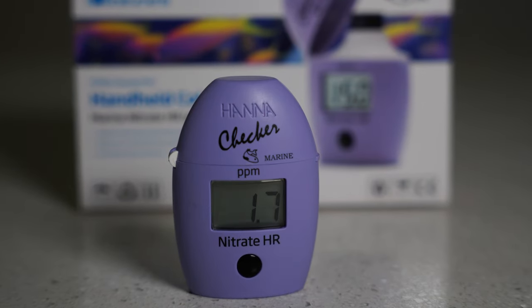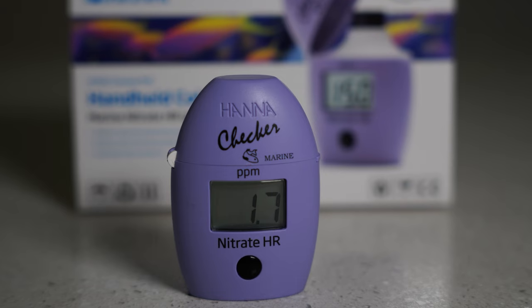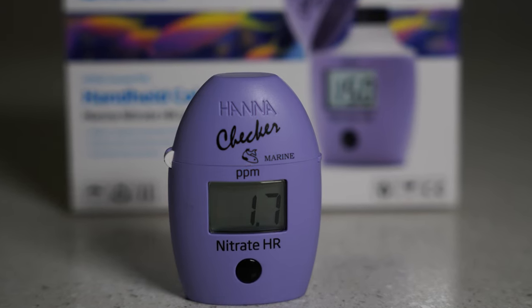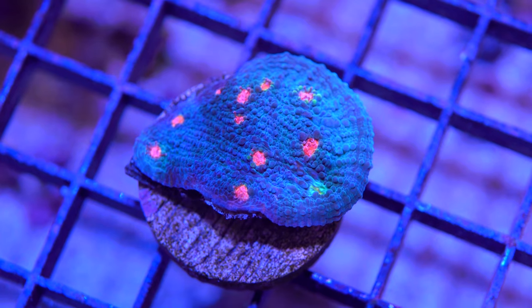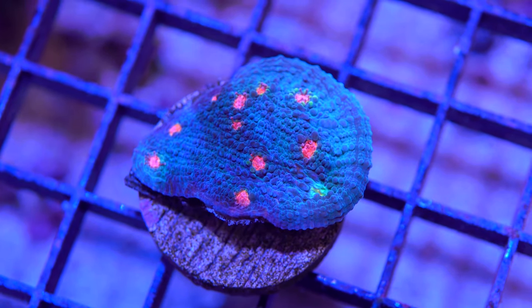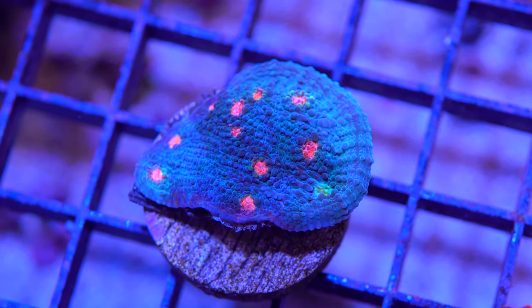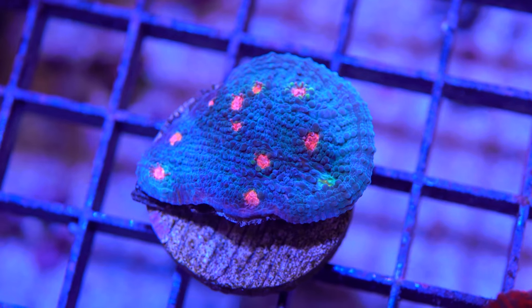The results are in — we're at 1.7 ppm for nitrate, which is a little bit on the low side. I like it closer to 10 to 15, but this means I need to increase my nitrates by feeding the corals more, feeding the fish more, or by turning off the protein skimmer for a few days and see how that works.